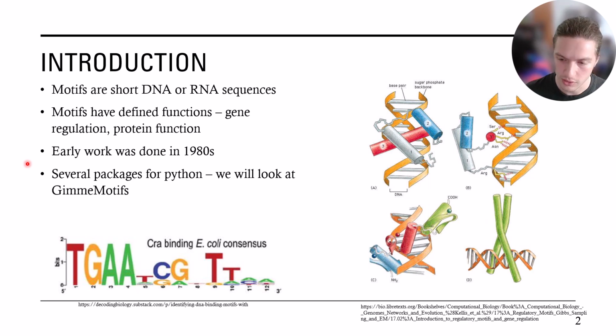And there's a lot of tools to be able to do this. We're specifically going to be looking at one in Python called GimmeMotifs that has been used in the past to analyze motifs.